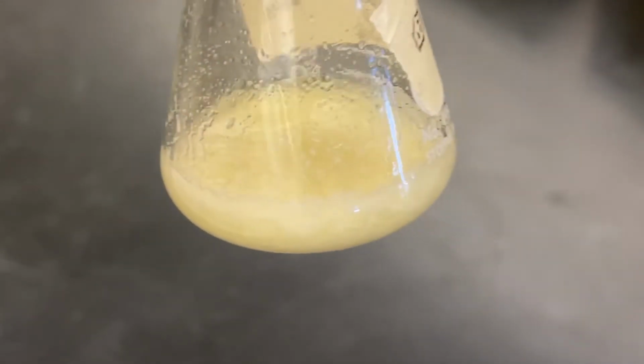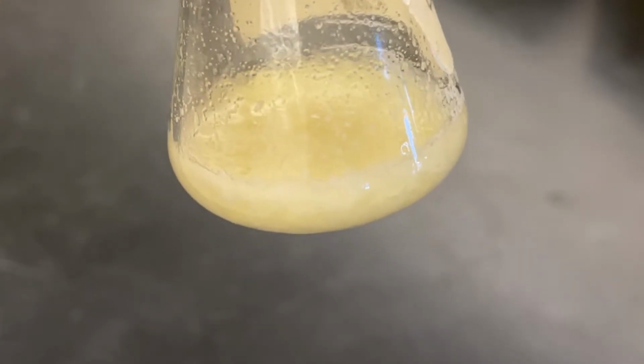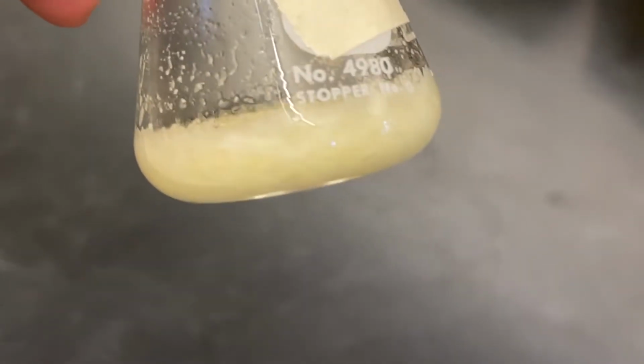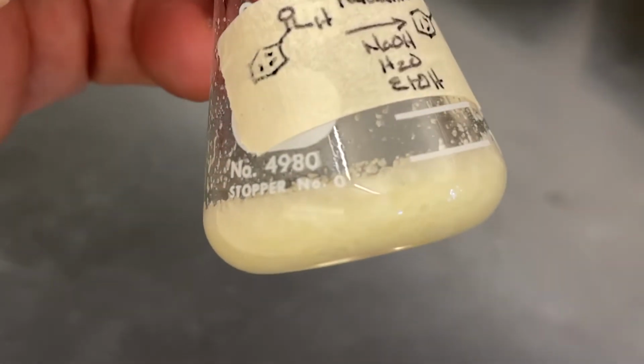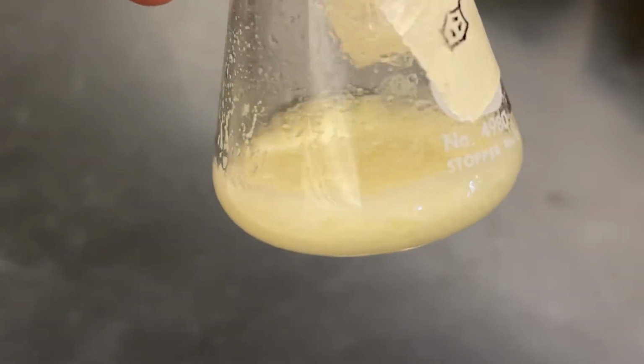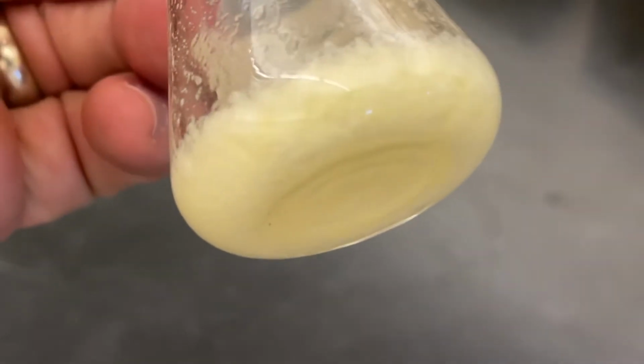I was concerned that it had failed, and so I added a tiny pixie dust bit of seed crystal, and it all went off super fast. And I should have known better. I should have put the camera on it so that we could film it and watch it crystallize as it did it. It was pretty cool, but missed it. So there's no going back.